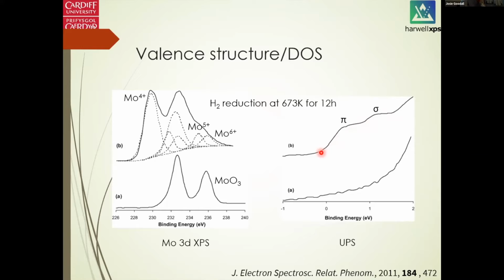And we don't see anything such as the molybdenum 5+. And this feature also indicates that on the surface of the molybdenum catalyst, there are either 4+ and the metallic bonding. So this is what the XPS does not observe.